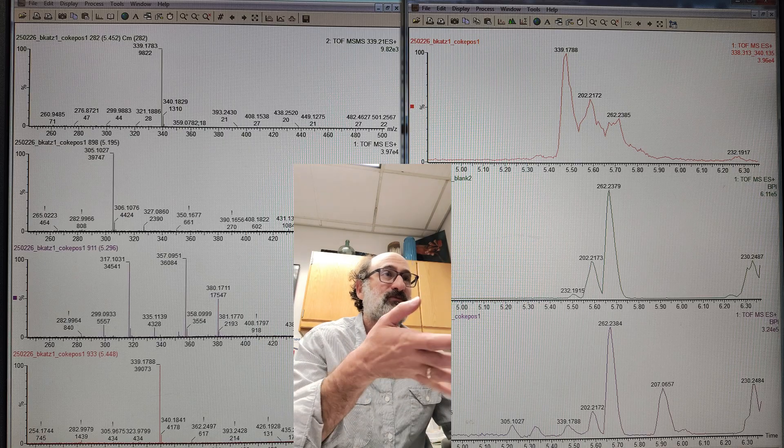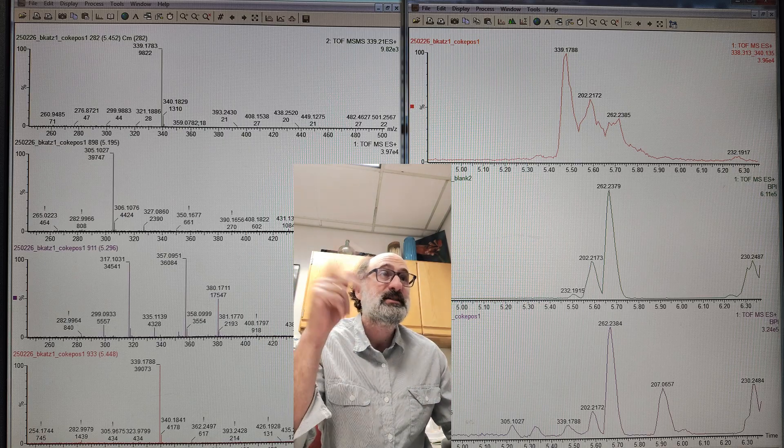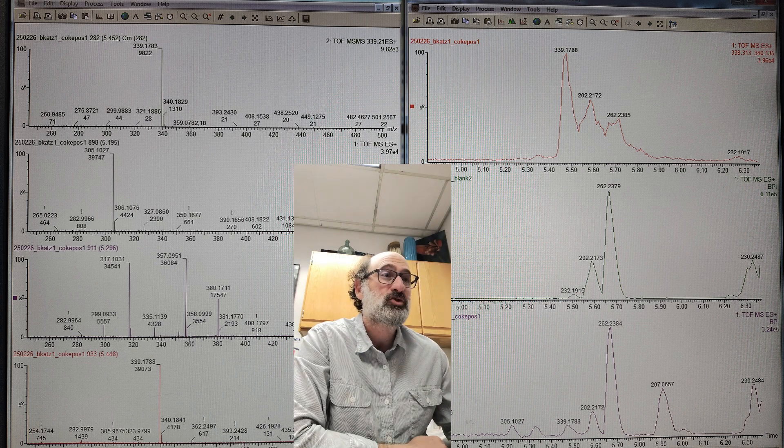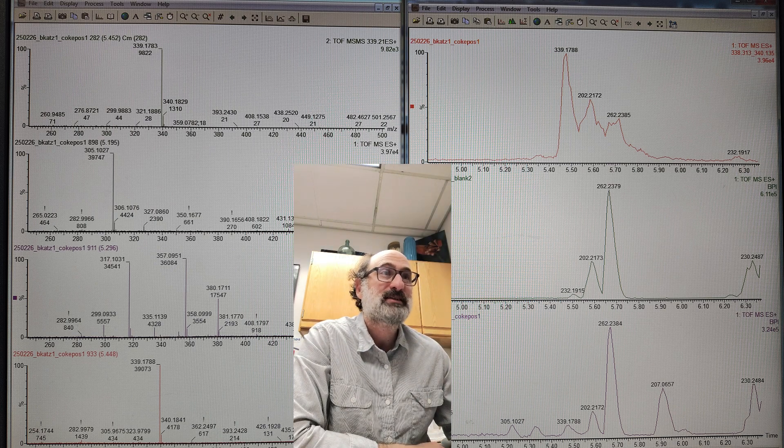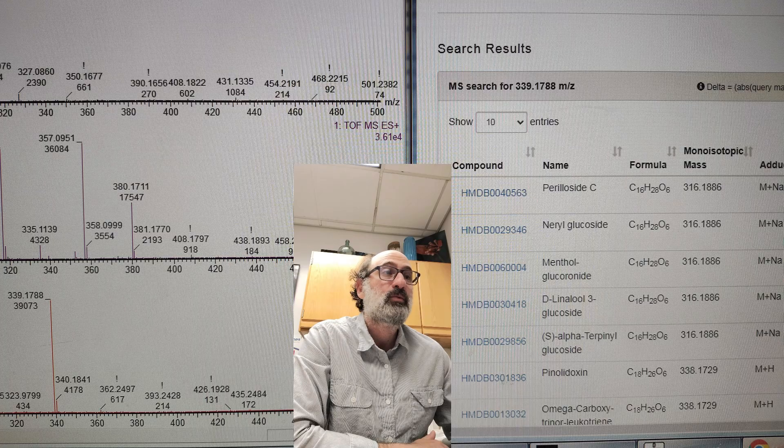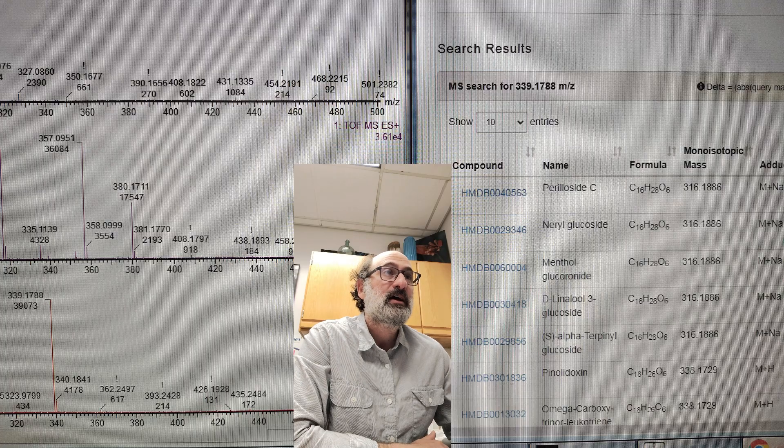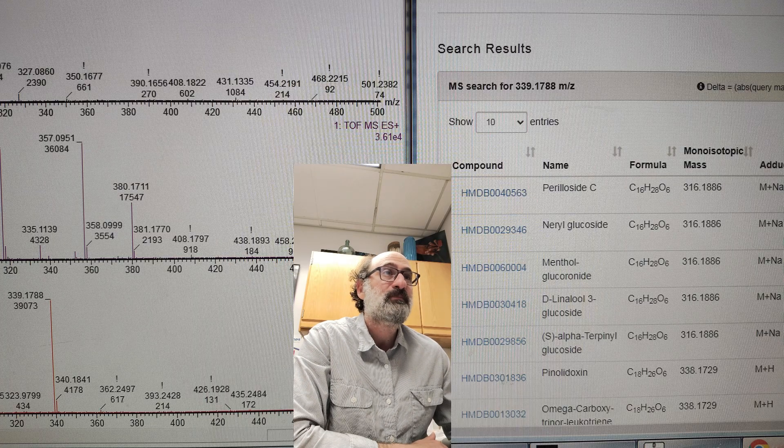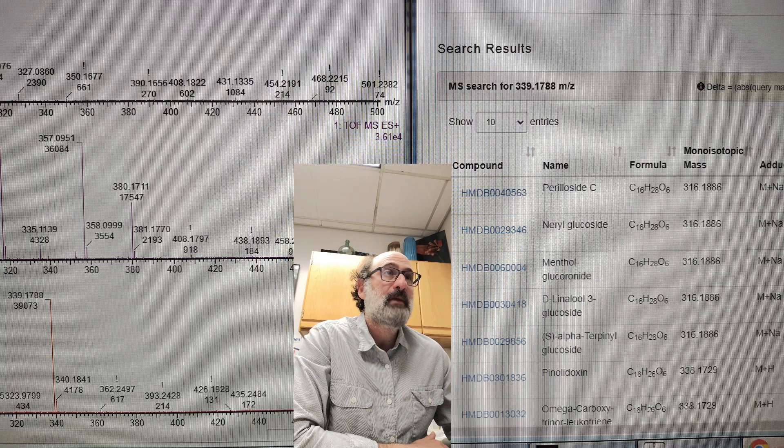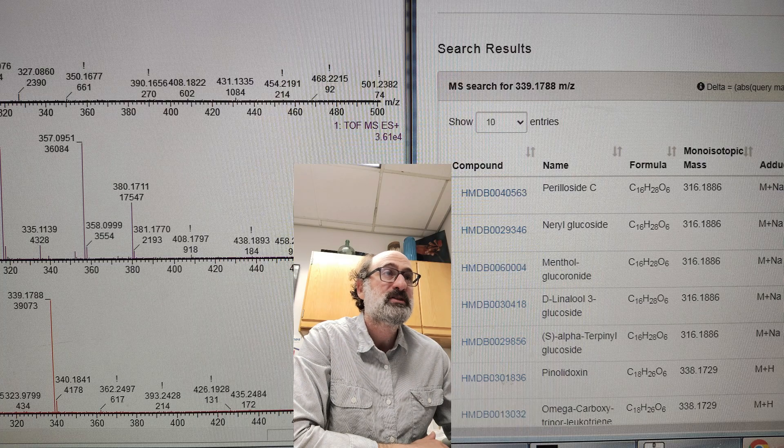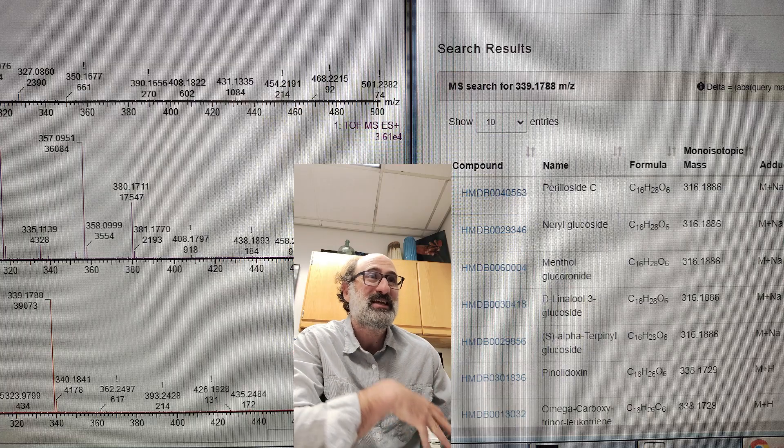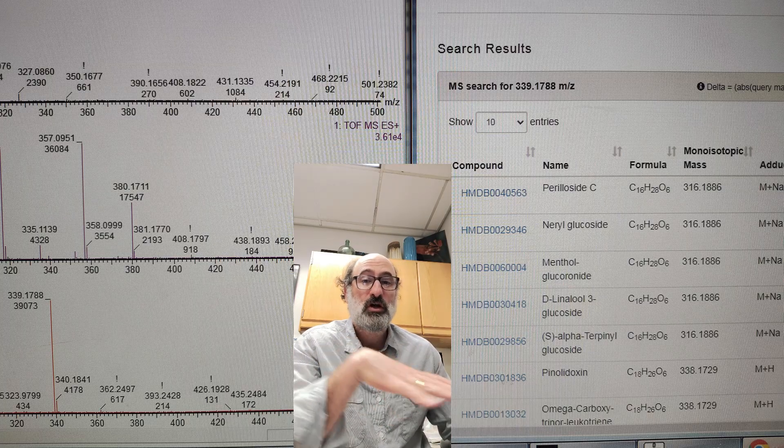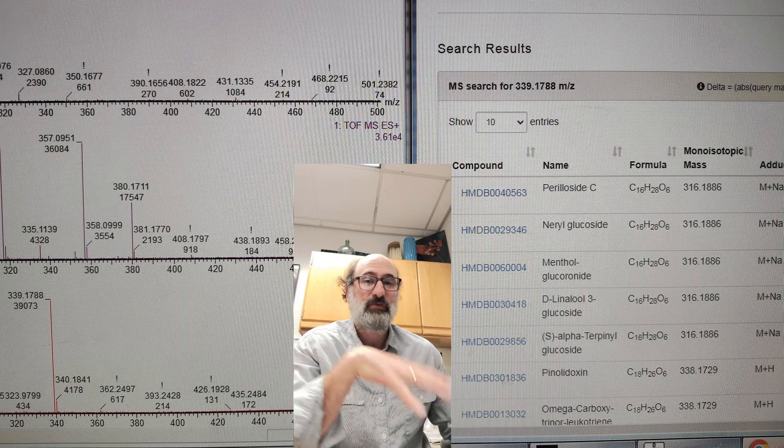I've done an EIC of this 339 mass, and you can see that elutes out in a cluster. Anytime I see, instead of one big sharp peak, a bunch of small peaks, I think natural product - just plants. That's how plants make things. When we search this, we're getting kind of a mixture. It could be a bunch of different things, but the cool thing is it's this menthol or linalool or terpenyl glucoside.